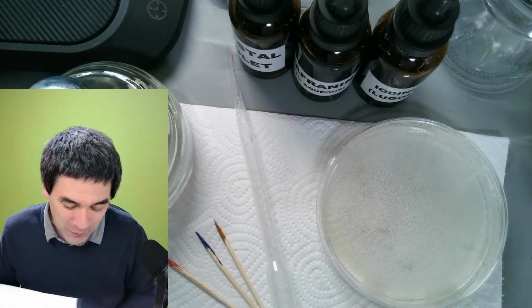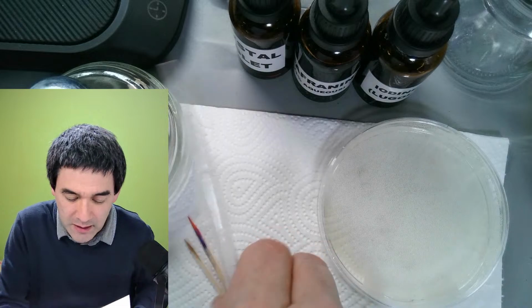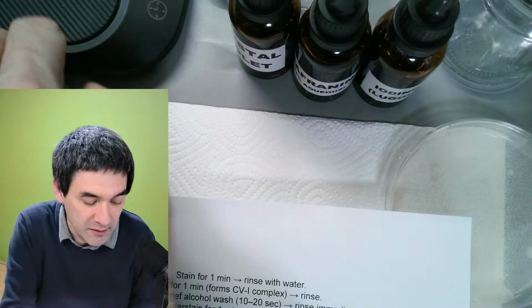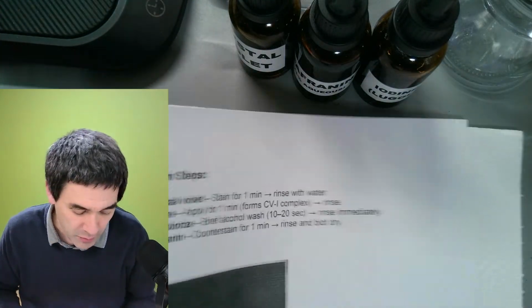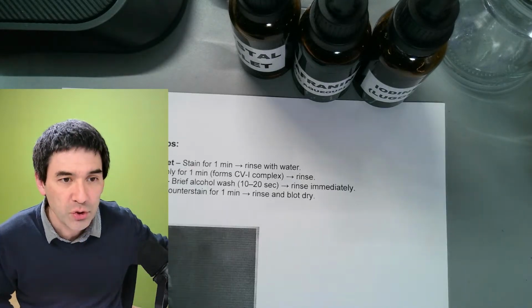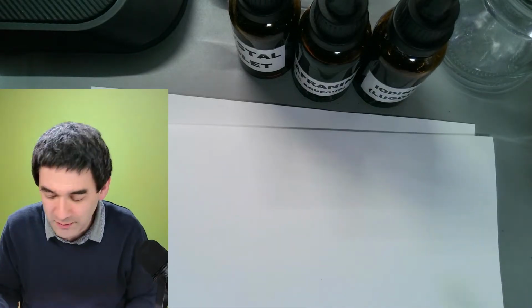Okay, so I'm going to quickly explain to you what actually happens here. This is going to be a 5-minute biology lesson, which I think still is important because we want to understand what happens here. And then after this short 5-minute biology lesson, I'm going to explain to you what happens.